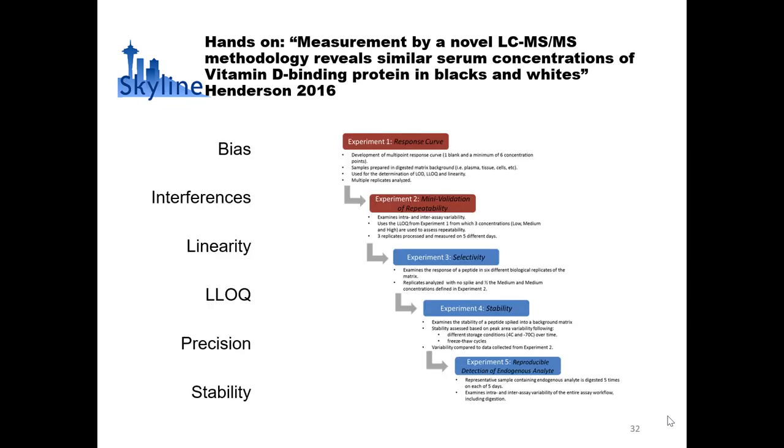Their different experiments are labeled maybe a little differently than the CPTAC guidelines, but it gets at all of these same questions. It assesses all of the same validations.